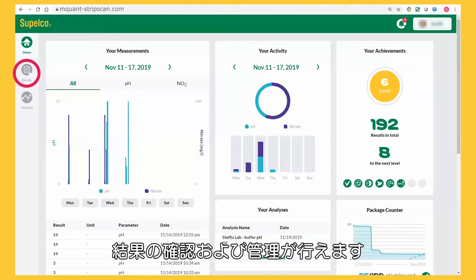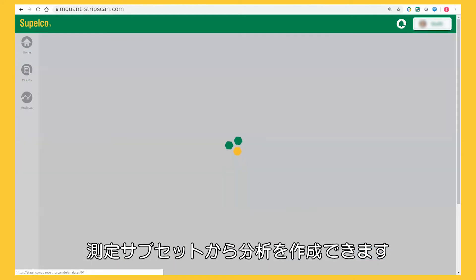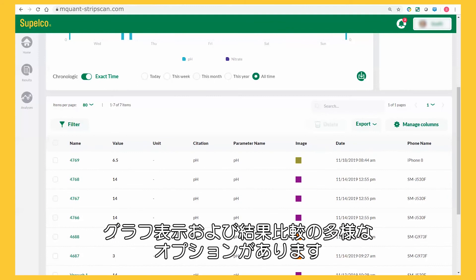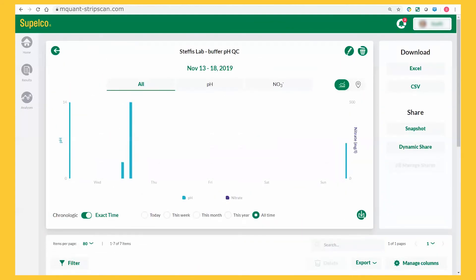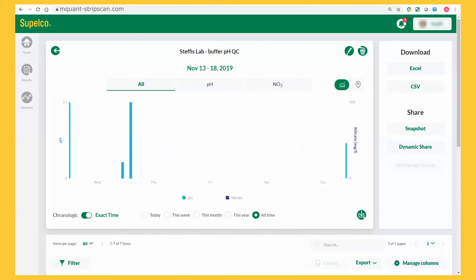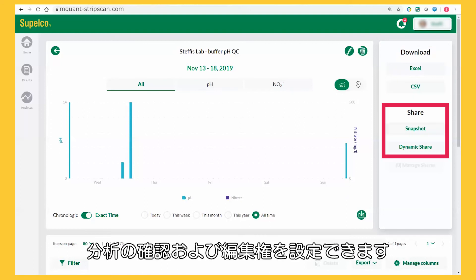You can view and manage your results — for instance, by creating analyses from subsets of your measurements. You have a variety of options to display, graph, and compare your results. You can also export datasets and set viewing and editing rights for your analyses.